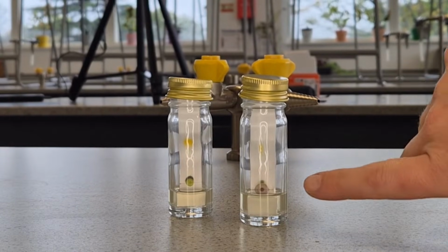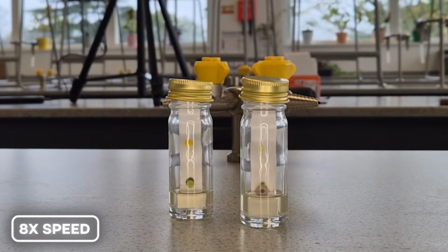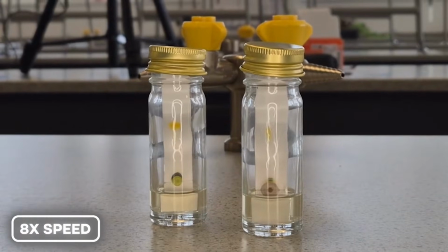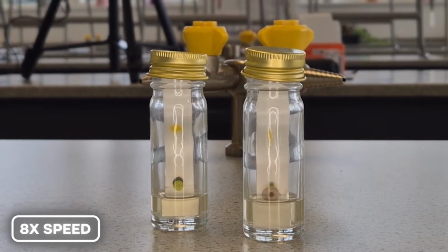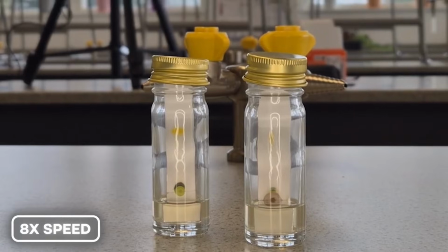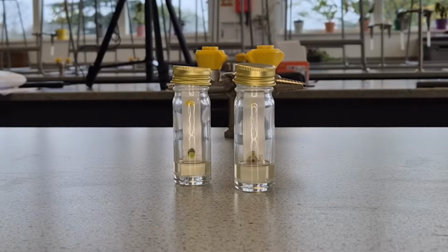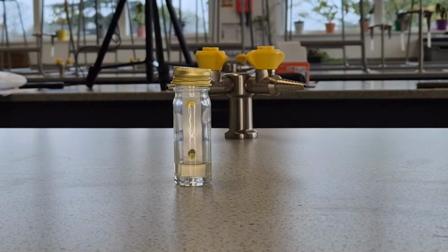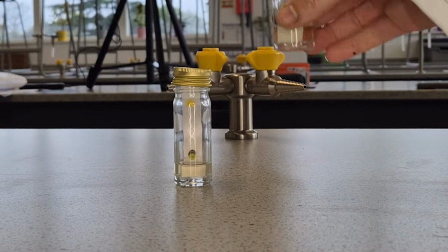Actually, this one, yeah, you can start to see a couple coming off the top. So I'm going to take mine out now before it reaches the top. I'm going to do it one at a time, so I can draw that solvent front on straight away.